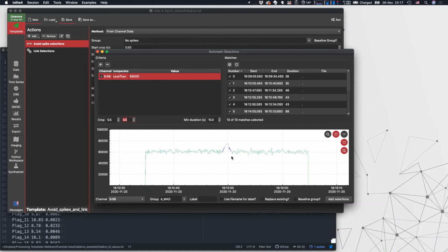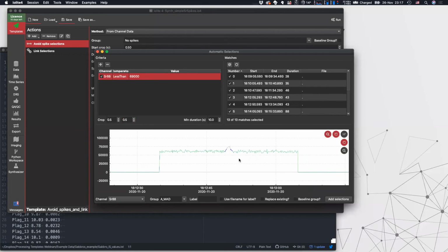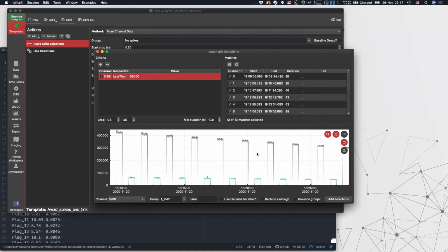But the point of this example is that I'm working on an input channel, which is affected by baselines and by sensitivity drift. If we zoom out our data completely, you can see that we have exactly 30% decrease in sensitivity over the course of this "experiment".